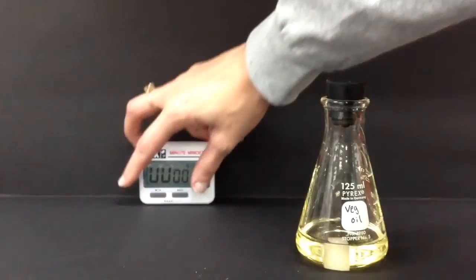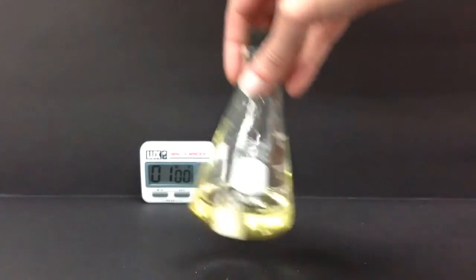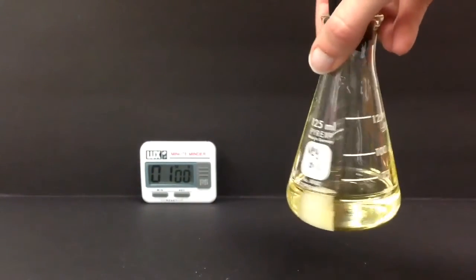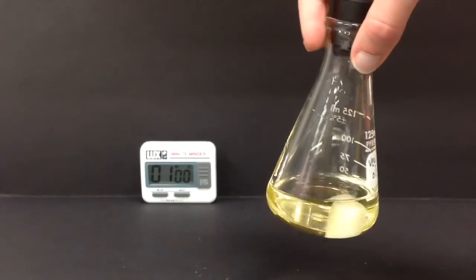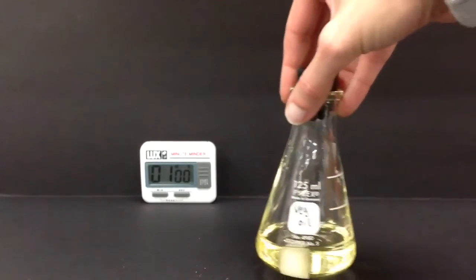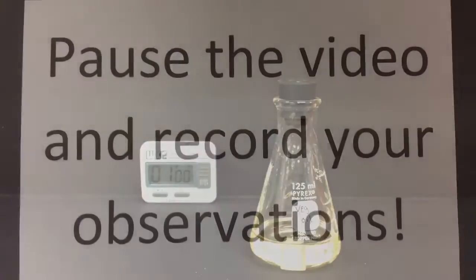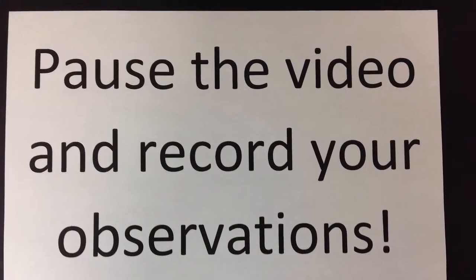Pause here again and write down your observations. Pause again and write down your observations.